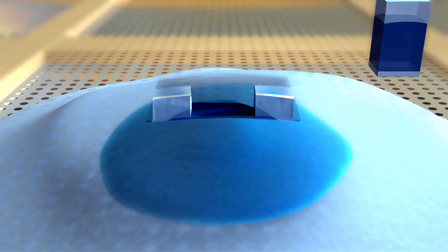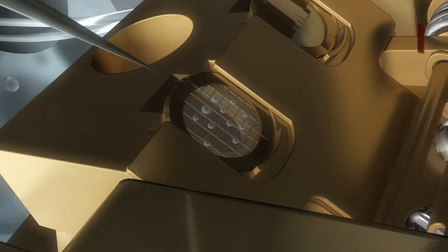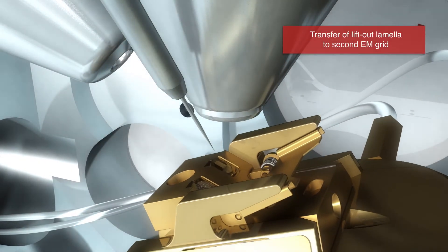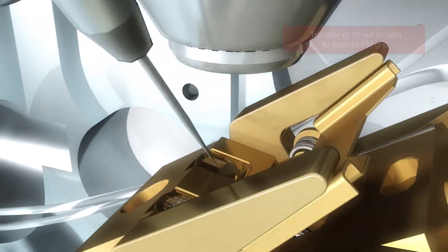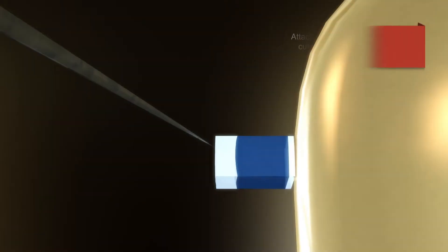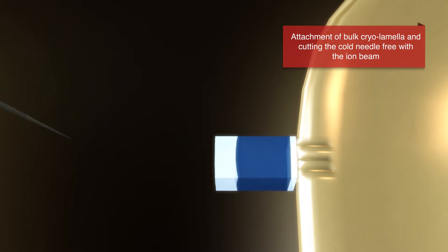The cut-out sample is then transferred to a second EM grid inside the Aqualose. This grid contains small side posts where the lamella is attached. After attachment, the needle is cut free.